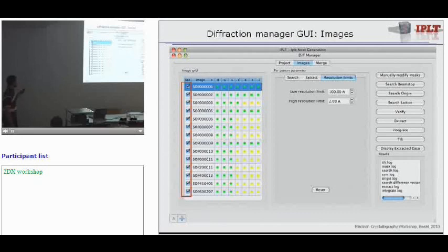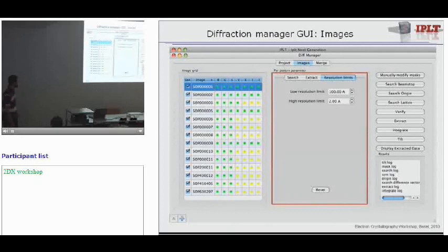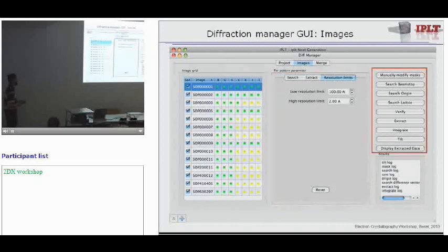So, this I already mentioned mostly in the first slide. You can easily remove data sets if they are not processing right. You just take out the check mark. You directly see how far every pattern is processed. For every pattern, you can set individual parameters for the processing. So you can have a different set of parameters for every pattern if you need to.